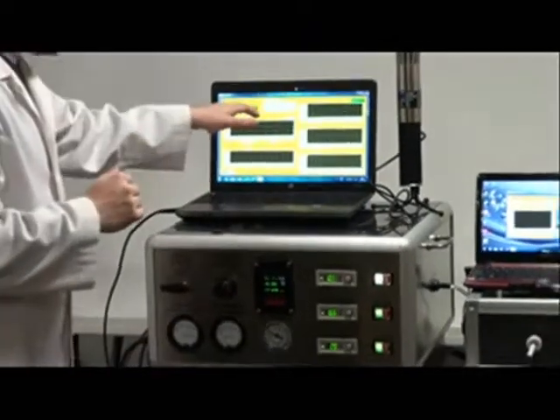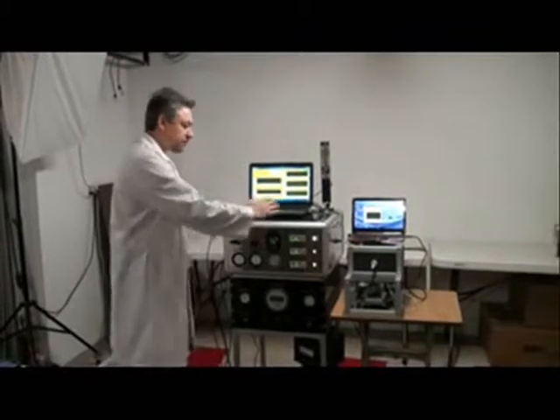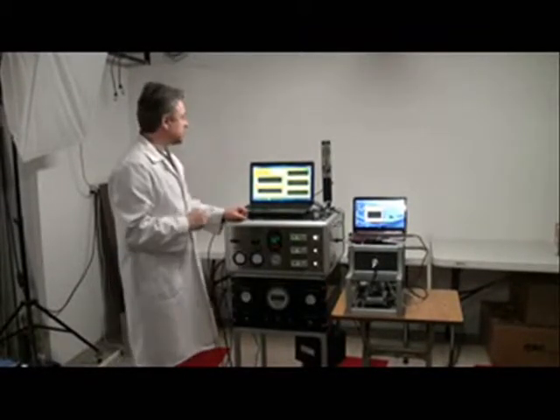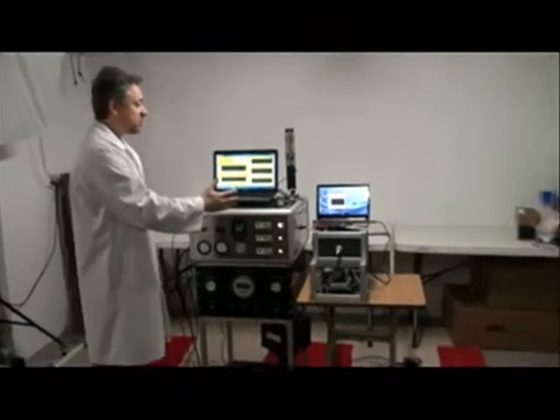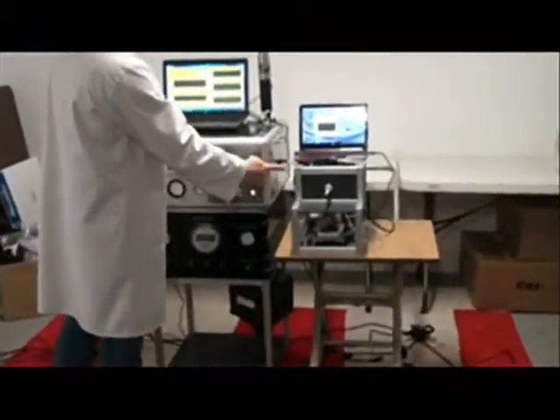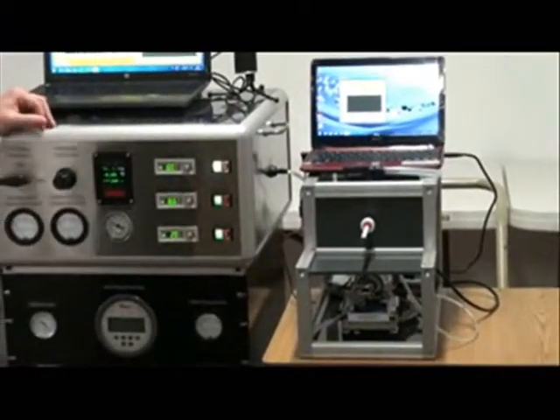That way, by managing the PID values for the response of the mass flow controller, the siphon can keep the concentration very close to the set concentration. Now what we are going to do is demonstrate the whole process with a single cigarette smoking machine smoking a V2 electronic cigarette.